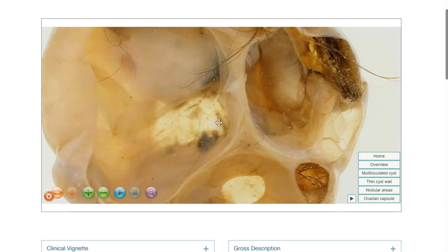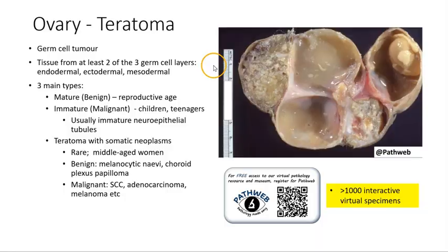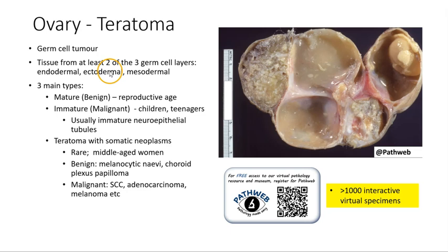Teratomas are germ cell tumors, and they contain tissue from at least two of the three germ cell layers, meaning endodermal, ectodermal, and mesodermal.